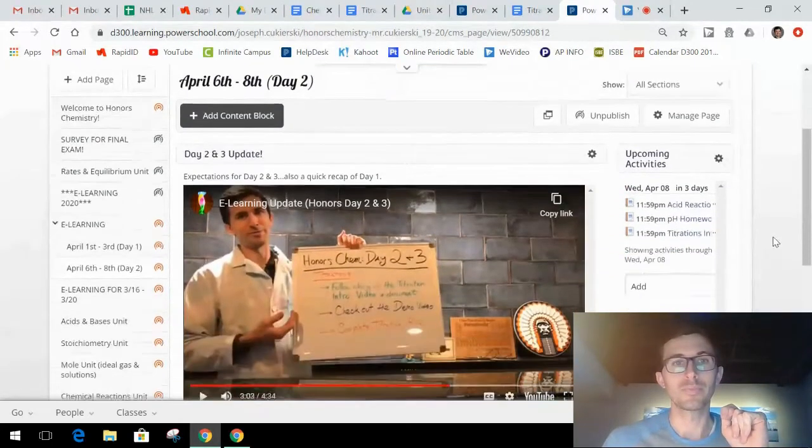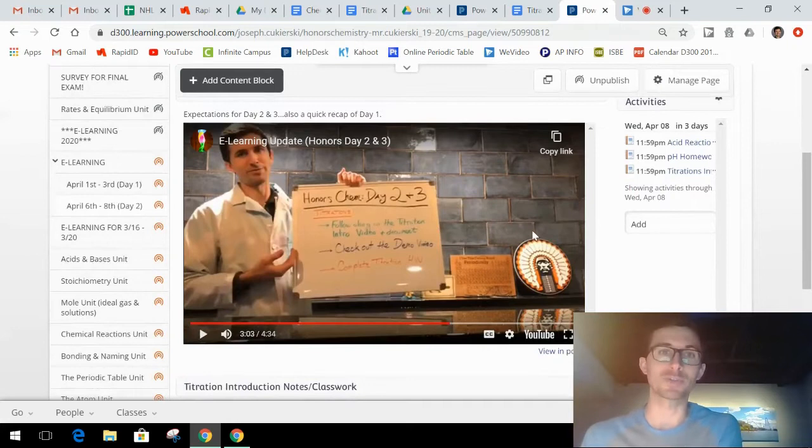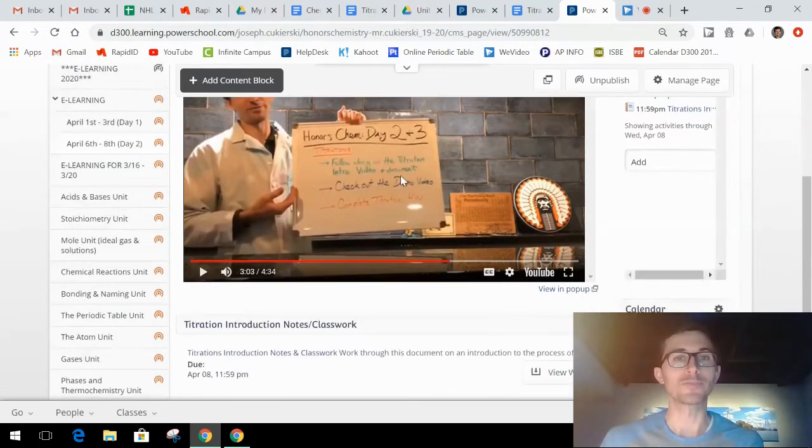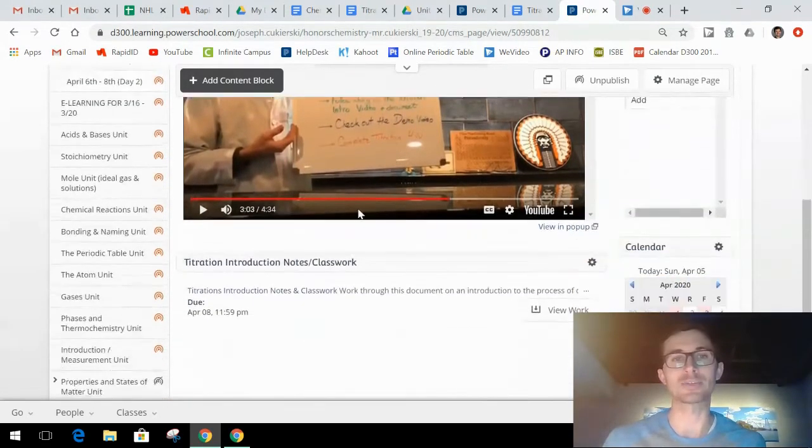On the e-learning page for the 6th through 8th, make sure, again, you watch the update. That just gives a quick recap of day 1, as well as some information, just some expectations for day 2 and also day 3. I'm not going to have an update for day 3 itself, so the update here will be for day 2 and 3. So for today, we are going to focus on, as the update said, titrations, chemical titrations.